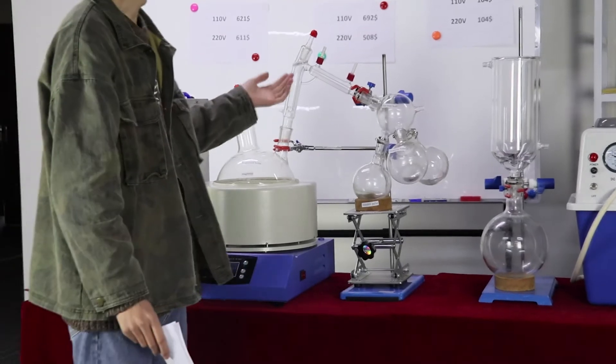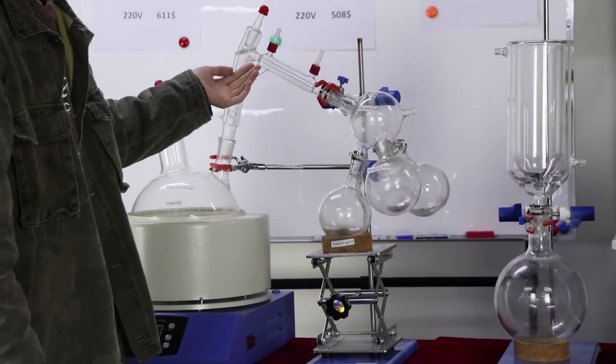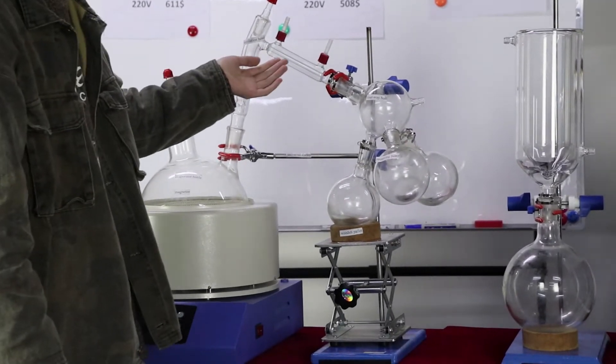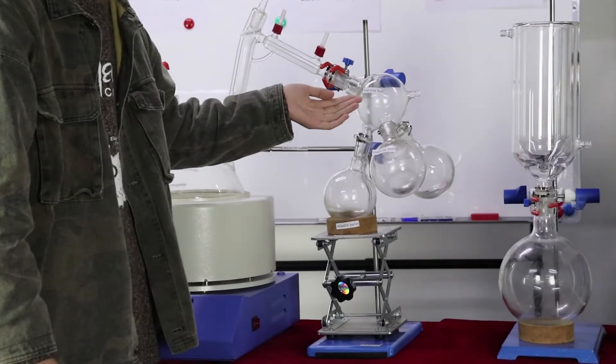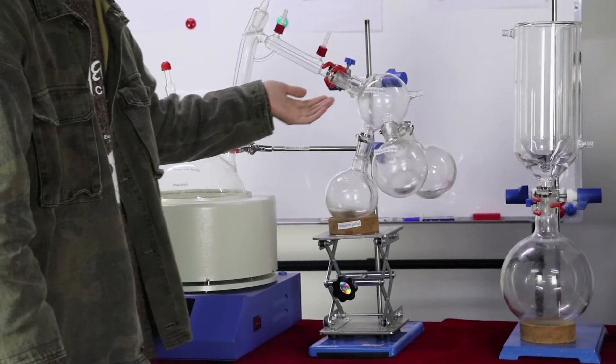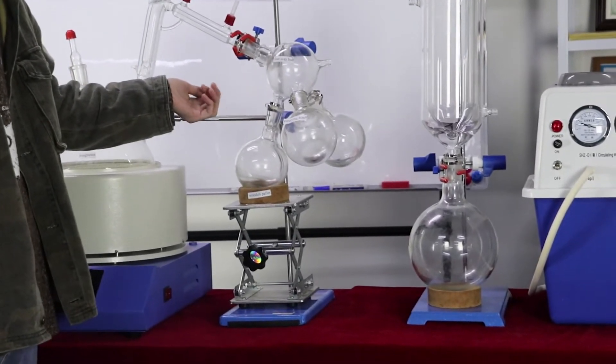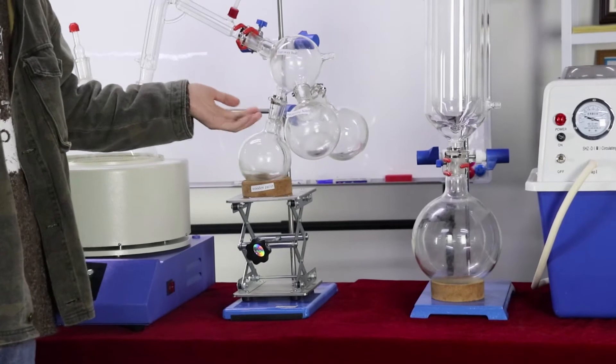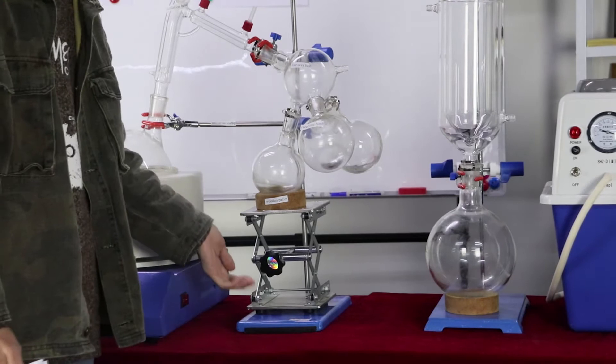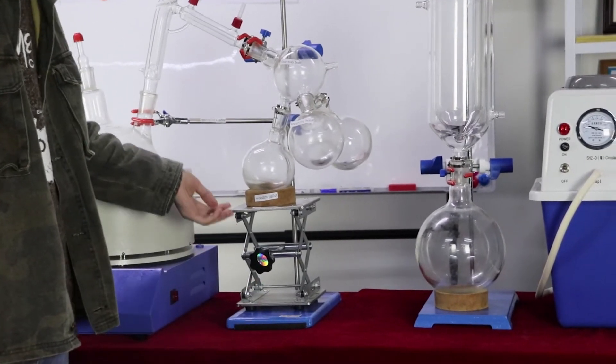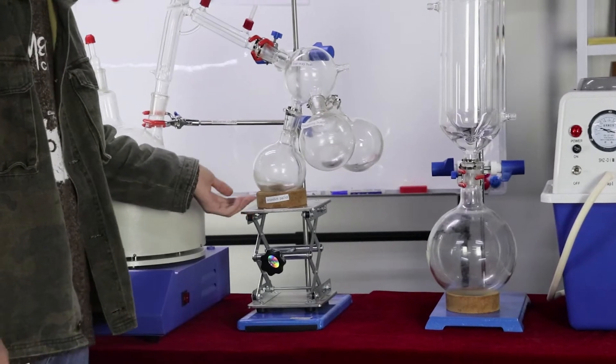Then, this is the distillation head. Then, this is the condenser. And this is the 4-way bottle. It connects the 3-way bottle. This is the iron platform and the wooden pallet, lifting platform.